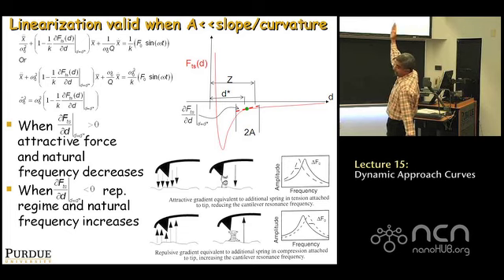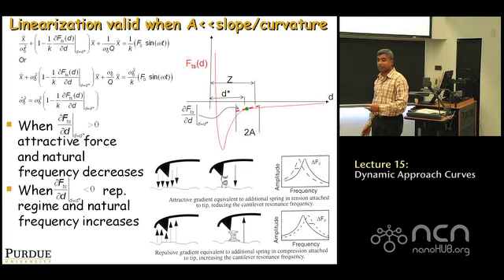When you bring the cantilever, the blue dot, very, very close to the surface, so that the green dot is now to the left of the minimum point in this force, partial F partial d becomes negative, correct? So to the left of the minimum, the slope is negative. And then going back to the equation of motion, you have another negative here. So two negatives make a positive, and that causes an increase in the resonance frequency.